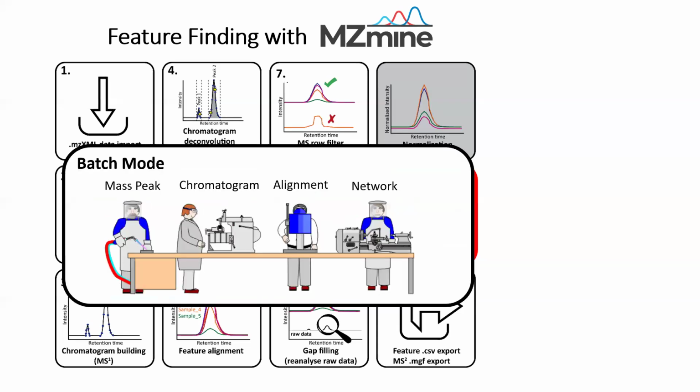But of course, instead of doing this manually, as I used to do before, you can save your processing batch, and you can repeat it, and you can let the software do it for you next time. So whenever you run all your data in the same condition and on the same MS instrument, it's more practical to save it in batch mode than to repeat it next time.